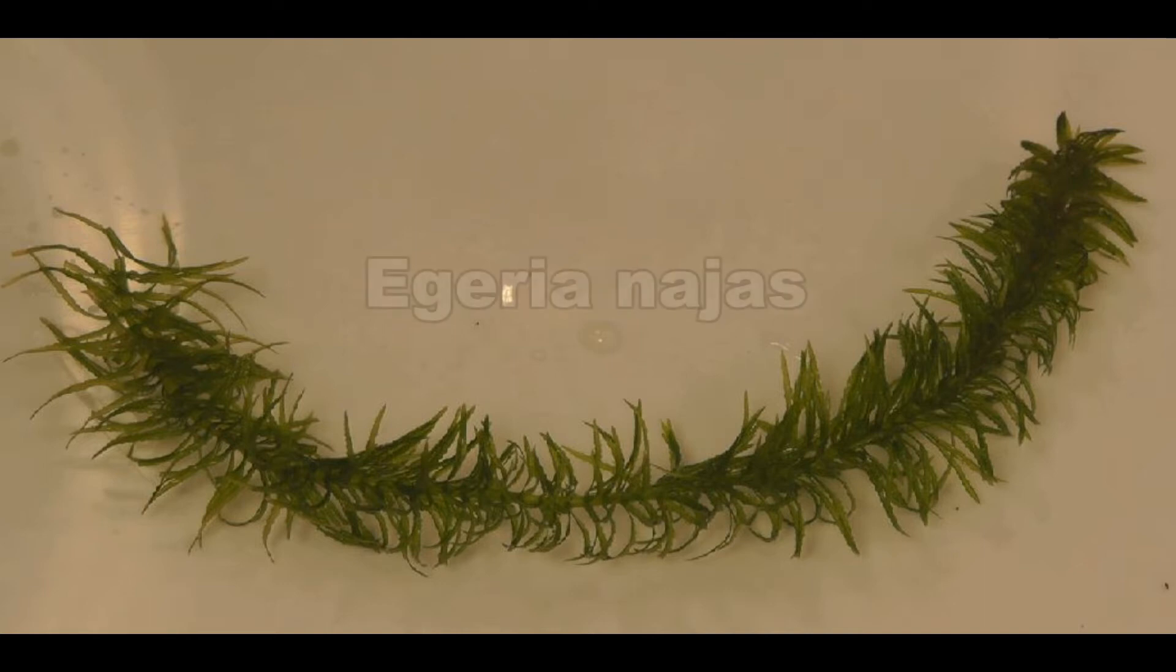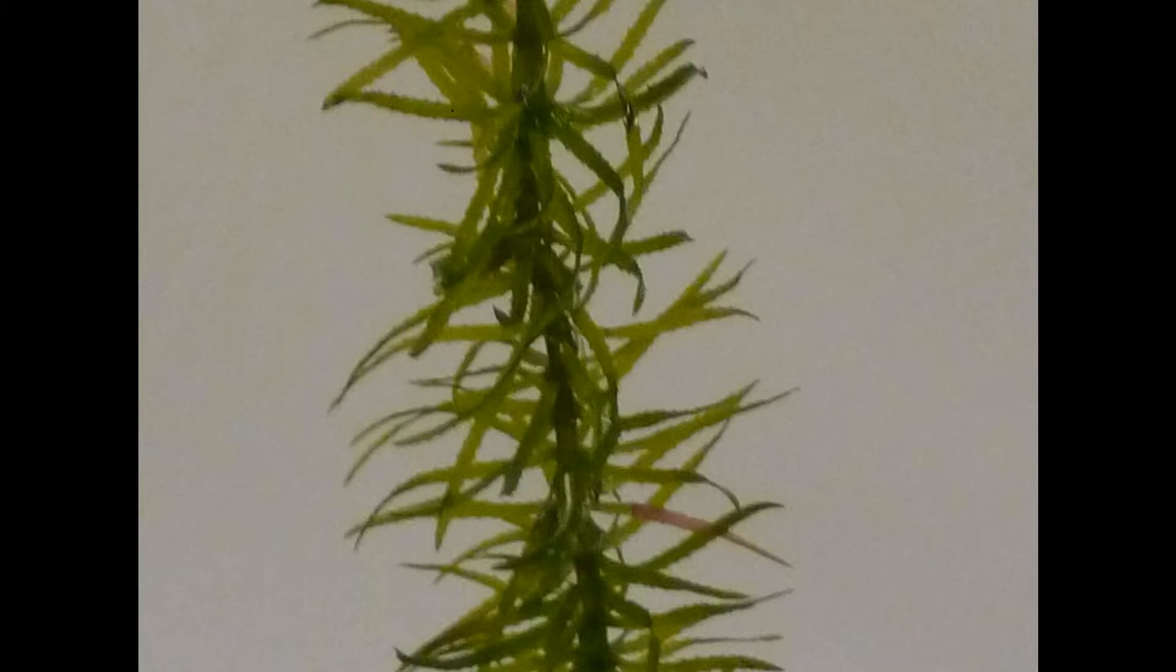At CLEAPSS we are currently using this aquatic plant in photosynthesis experiments. This aquatic plant is native to South America and is called Egeria najas. Egeria najas has narrow serrated leaves and a sturdy stem.